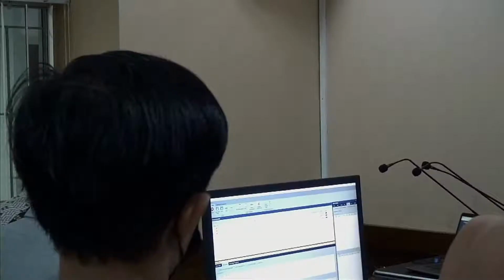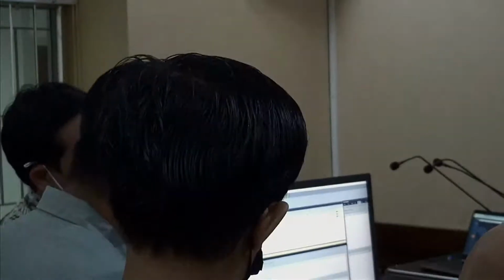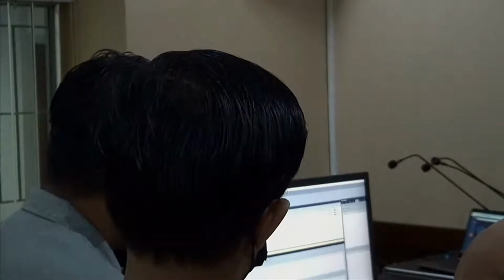But still, the limits in the ISO norm here are not higher than 2%, not higher than 1.5, and not higher than 2.5. So as you can see, we are way below that. We are even below 0.1% for each of these values, when the lowest upper limit would be 1.5%. So absolutely a good measurement, very nice.